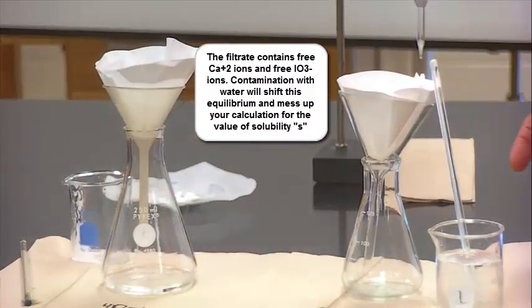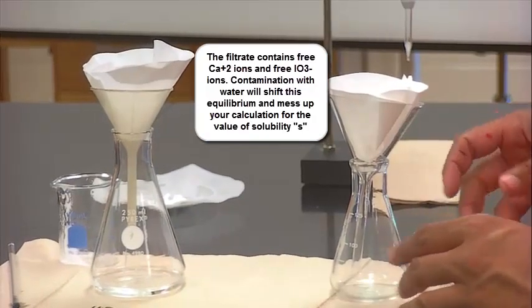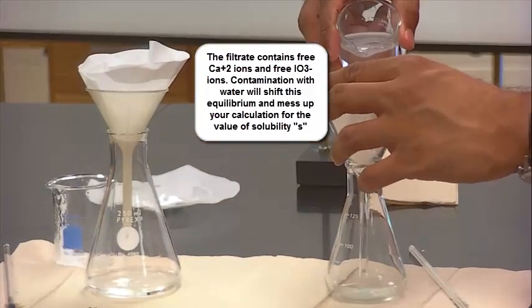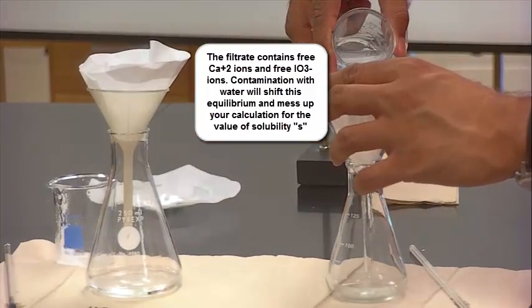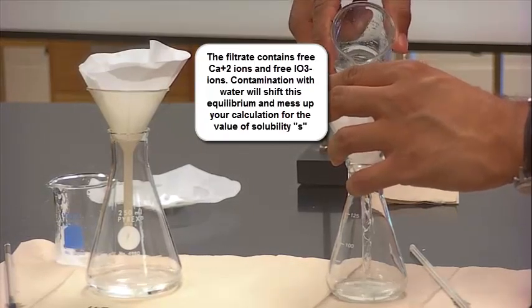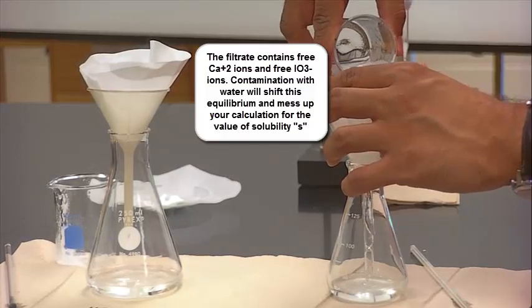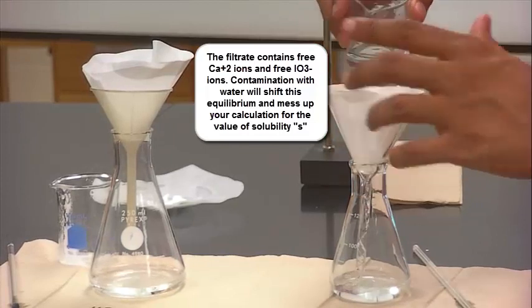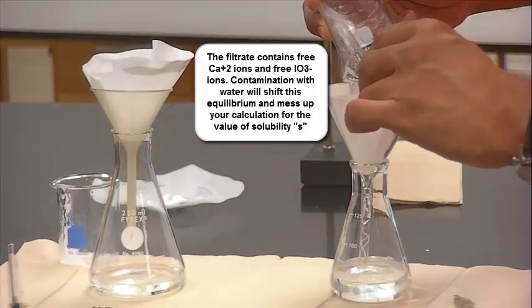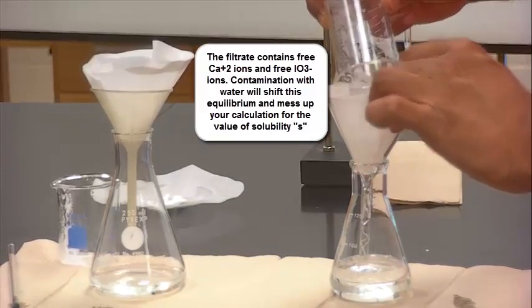Let's do this for the precipitate that was in the 80 mils. In a dry piece of filter paper. You want all your glassware to be as dry as possible. And of course you want your filter paper to be as dry as possible as well. Here. You can use a spatula as well. I'm using a glass rod.